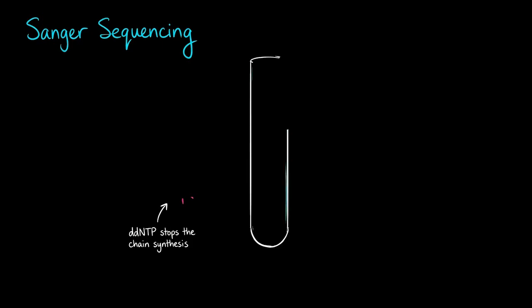Sanger sequencing exploits what happens if that chemistry is interrupted. Along with normal nucleotides, the reaction includes dideoxynucleotides. These lack the 3' hydroxyl group. If one is incorporated, the chain cannot continue because there is no nucleophile for the next bond. Modern Sanger sequencing labels each dideoxynucleotide with a different fluorescent dye. The reaction produces fragments that stop at every possible position.